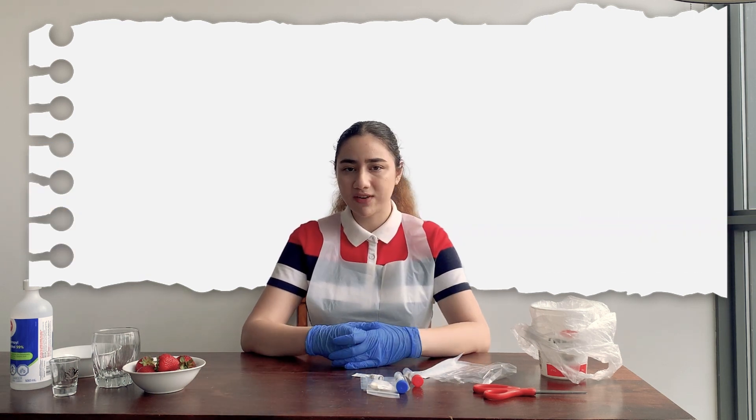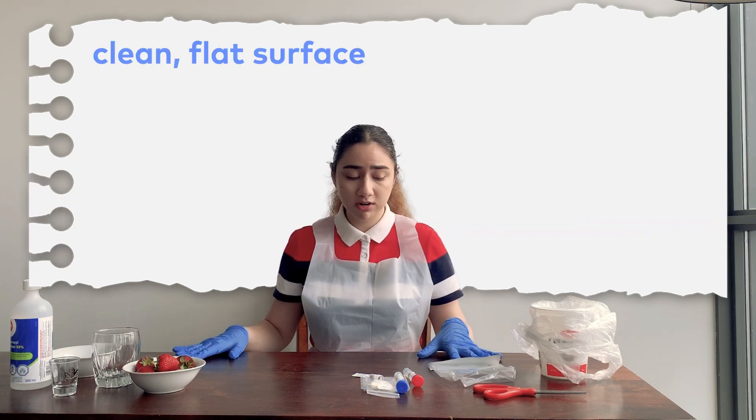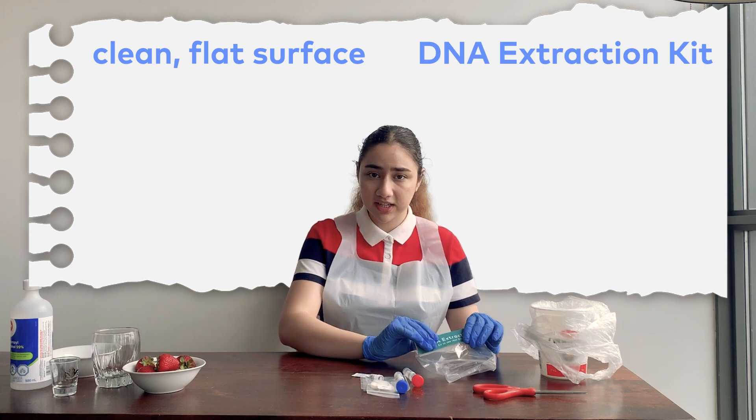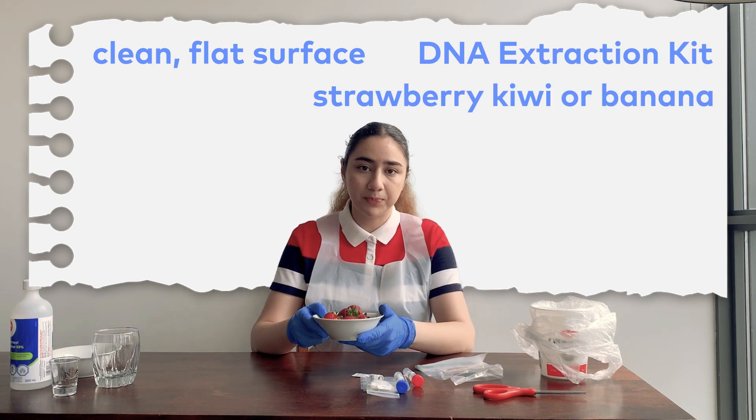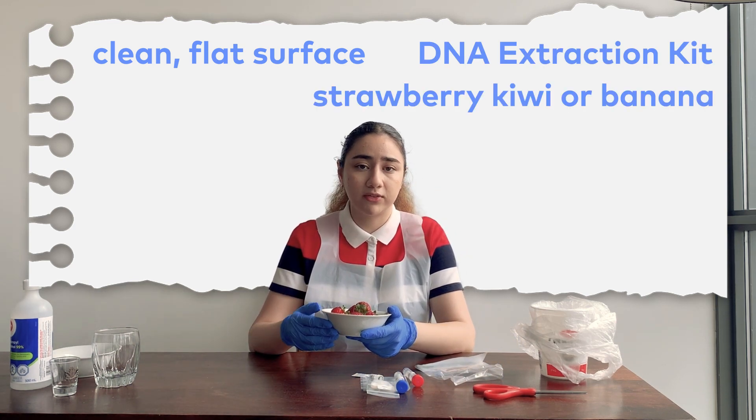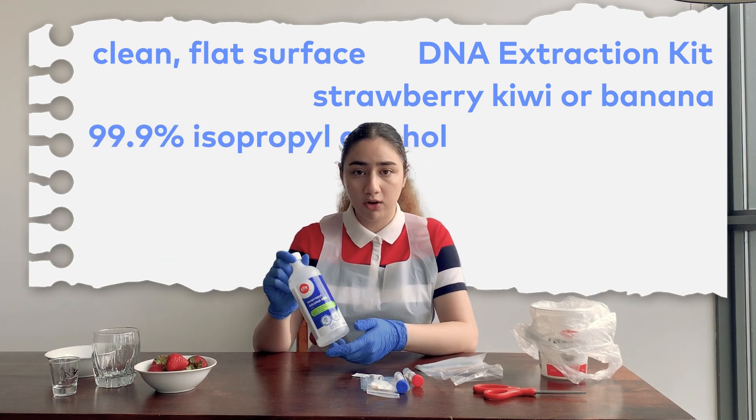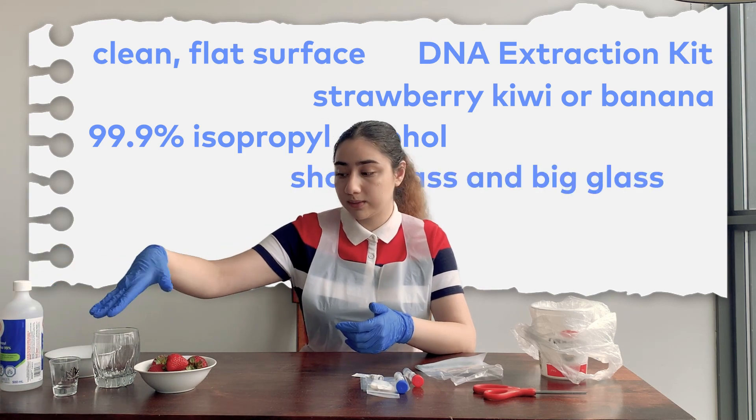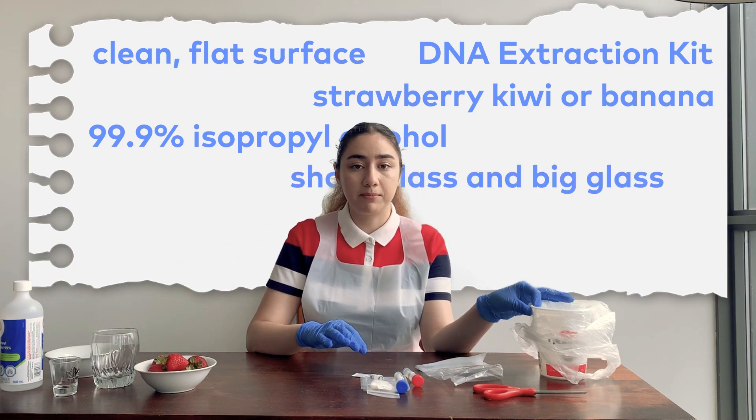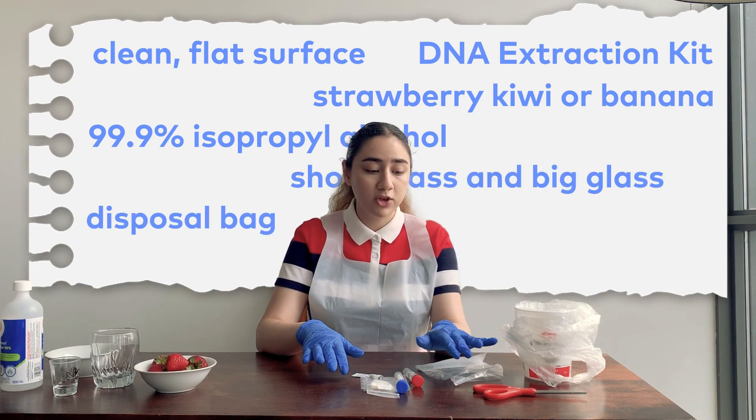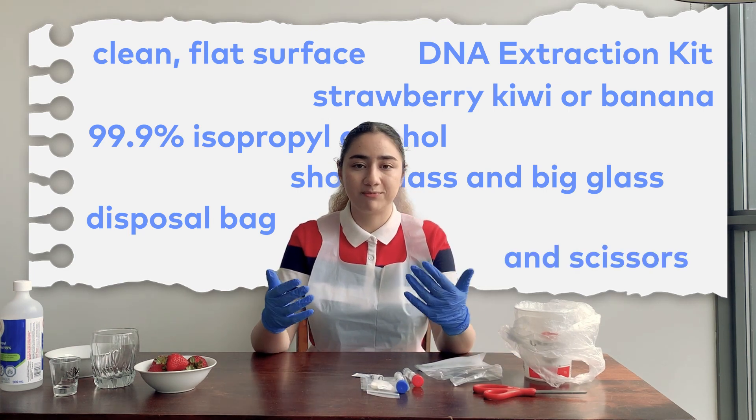Step 2 is setup. Make sure you have a clean and flat surface to work on. You have your DNA Extraction Kit, your strawberries. And if you can't find strawberries, you can use kiwi or banana. You have 91% or 99% isopropyl alcohol. You have a shot glass, one more big glass. You have a bag to put the things you don't need anymore, a pair of gloves and scissors. And you are ready to go.